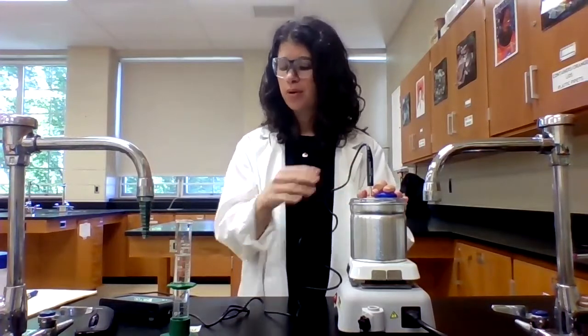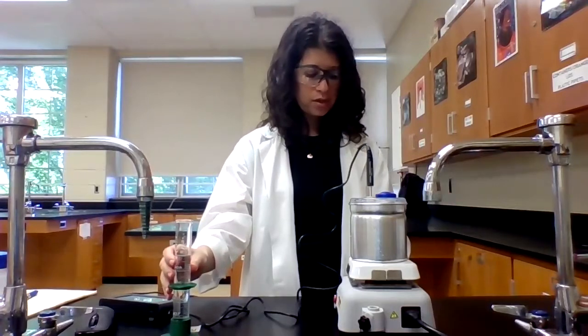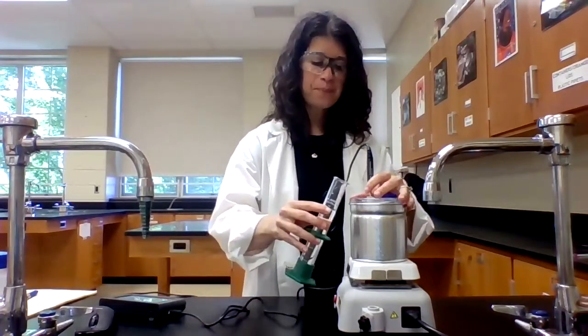The reaction will start. I'm not going to record the first temperature until after 20 seconds. I'm still going to record the temperature every 20 seconds for 3 minutes. I will then use that data to make a graph and figure out what that instantaneous temperature was at time 0. I can't experimentally determine the temperature at time 0 because the temperature probe isn't going to record the temperature quick enough. So I'm going to extrapolate using the graph. That's why I'm monitoring the temperature every 20 seconds. All right, so everything is set up, ready to go. I'm even going to turn the stirring on already.